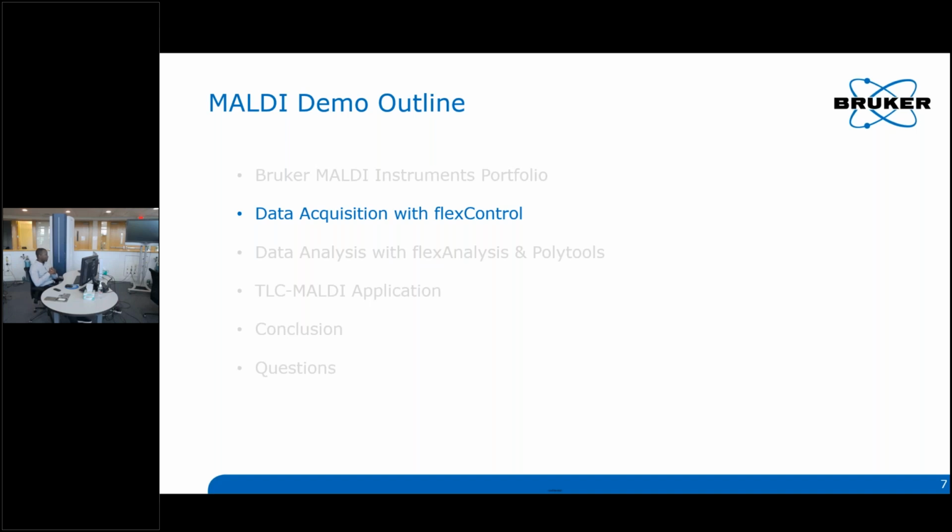We have three software programs that make up our polymer analysis workflow. These are integrated and talk to each other from beginning to end, so you don't have to acquire data, save it, and then open another software to process it.